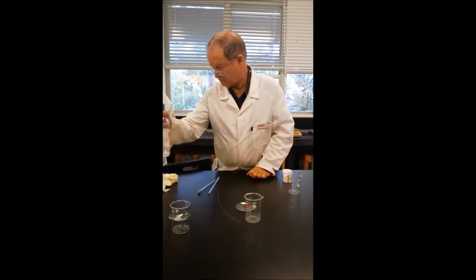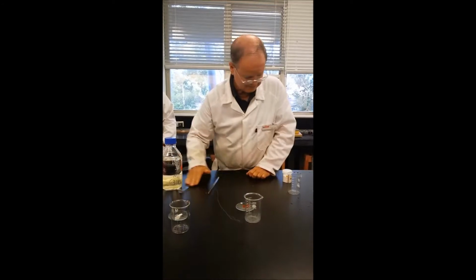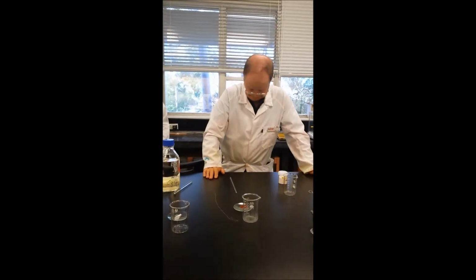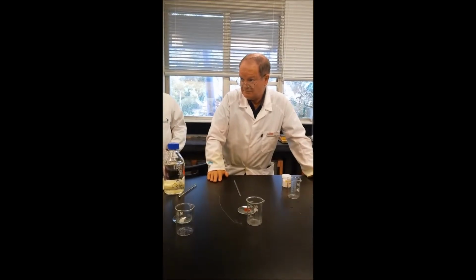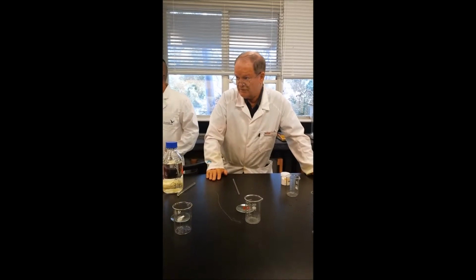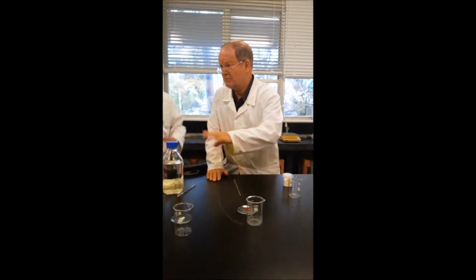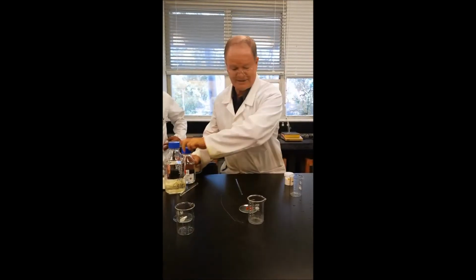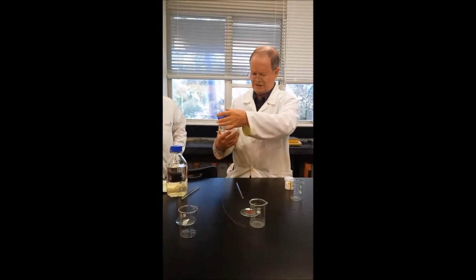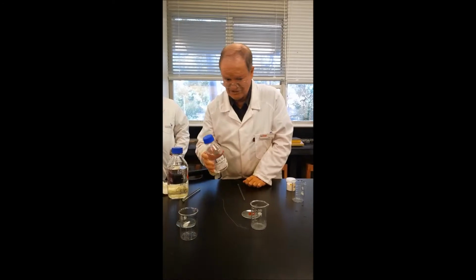So we have got, where is the measuring cylinder? If you can't be accurate and you put too much in, look, it's not the end of the world. It'll probably be left behind in the bottom, and you rinse it out at the end. What's this? No, I don't want that. I want the measuring cylinder. Oh, sorry. The measuring cylinder, please.